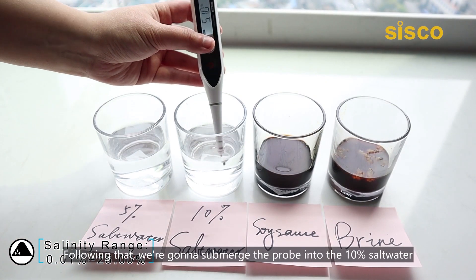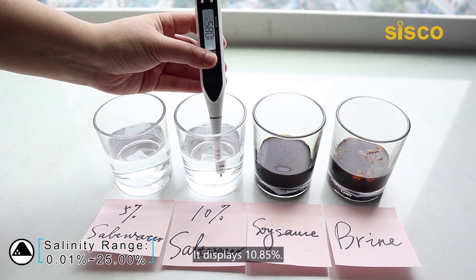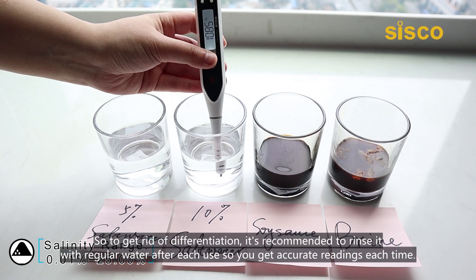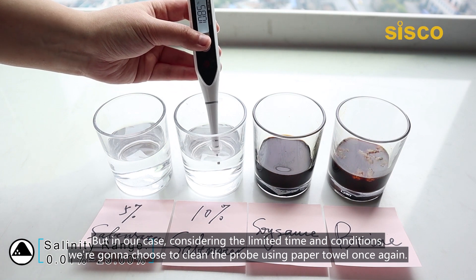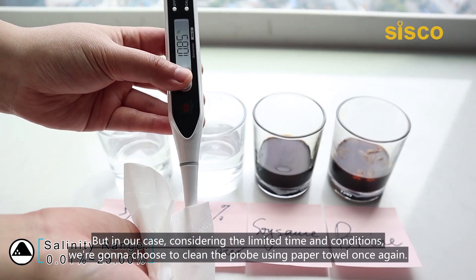Following that, we're going to submerge the probe into the 10% salt water and again wait for a few seconds until the unit beeps twice quickly and the backlight is on. It displays 10.85%. Well, that seems slightly different. It's assumed that there may be some salt residue on the probe. To get rid of the discrepancy, it's recommended to rinse it with regular water after each use so you get accurate readings each time. But in our case, considering the limited time and conditions, we're going to choose to clean the probe using a paper towel once again.